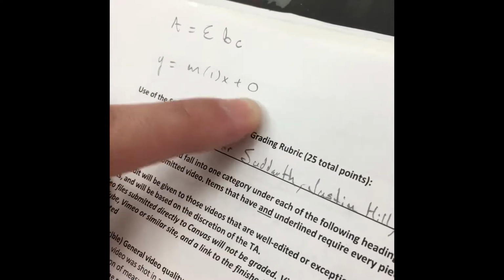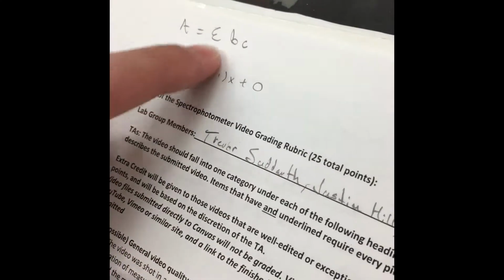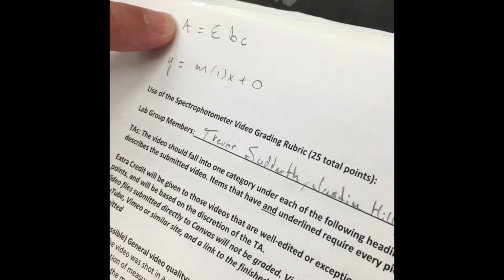b, the path length, is always just going to be 1 centimeter, so it cancels out in the equation, and we get an equation similar to a line where we have y is equal to mx plus 0, 0 being the y-intercept, and all of these values matching up to the ones above it.